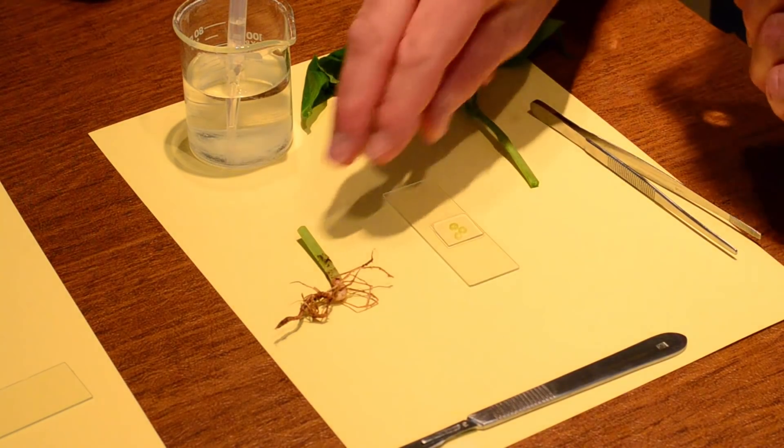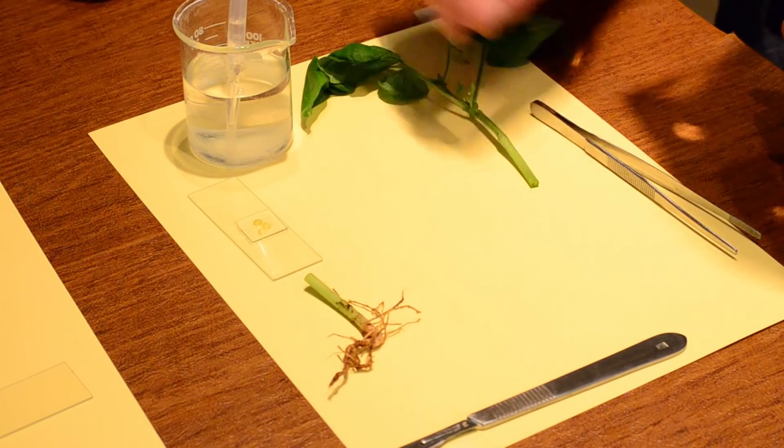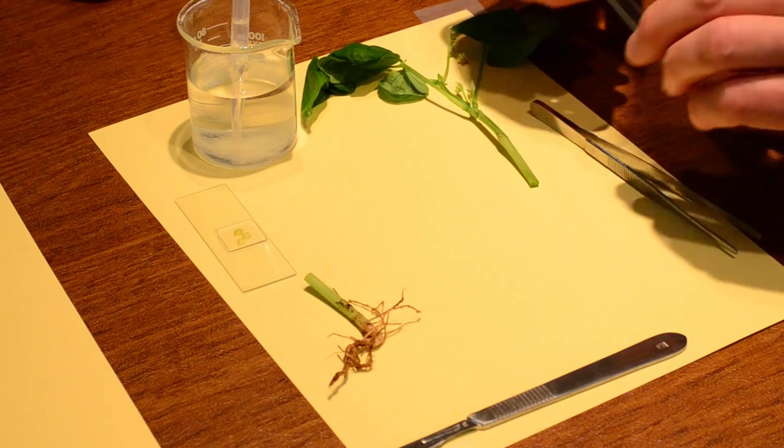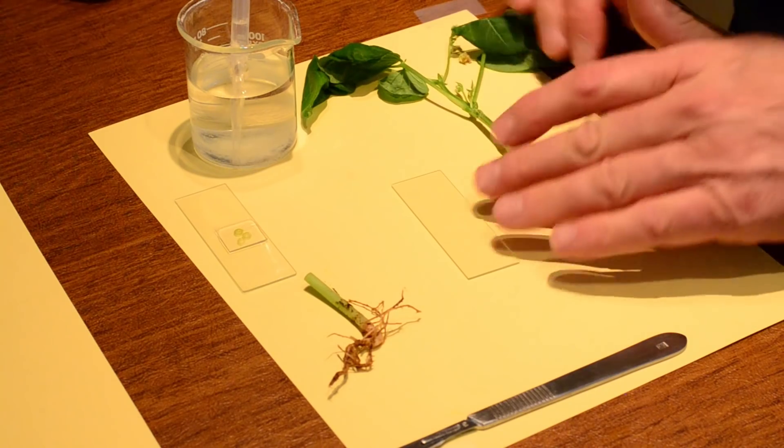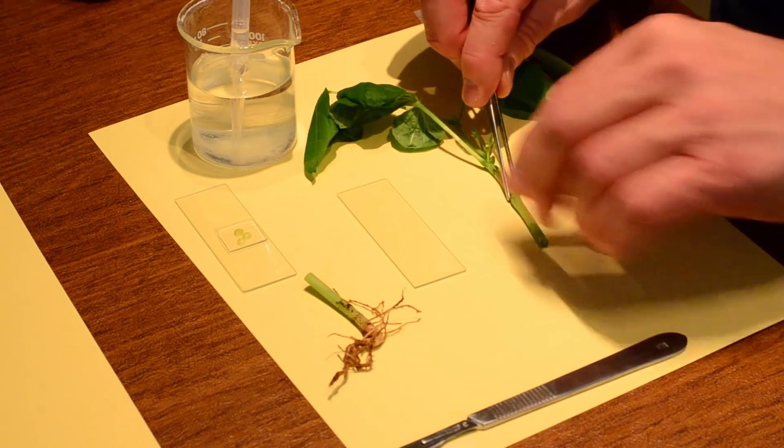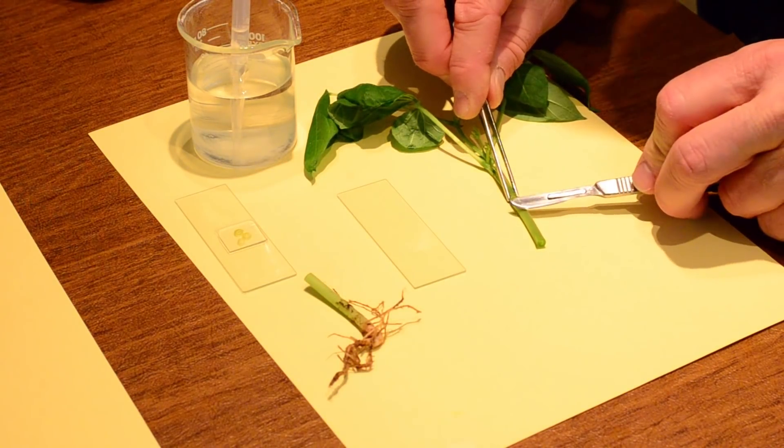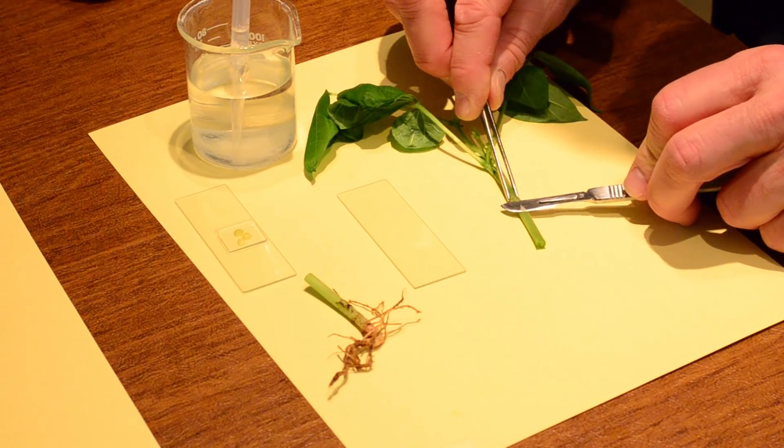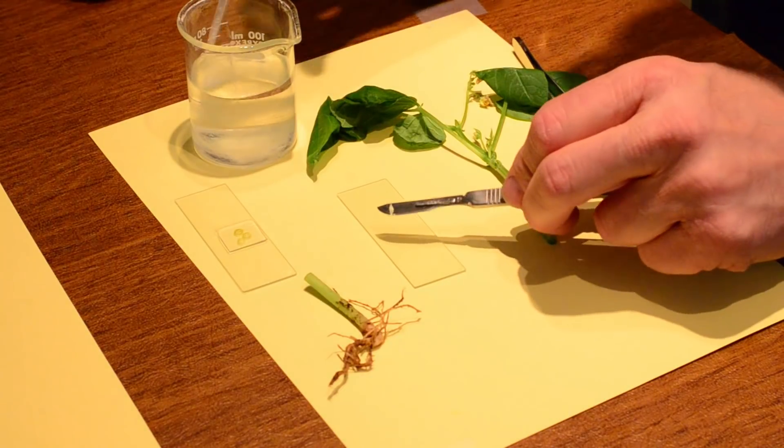All right. The next one, I'll push this off to the side here, is we do a longitudinal section. And I'm going to get my new slide here. And again, I'm going to grab the stem. And I'm going to make a decision right here. I'm just going to just barely go underneath. Make a nice little cut. Right there.